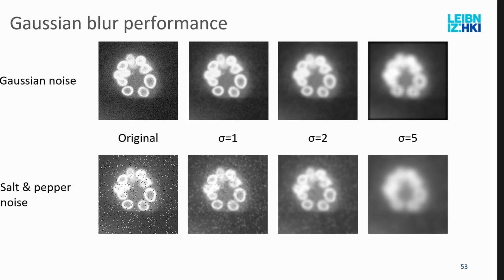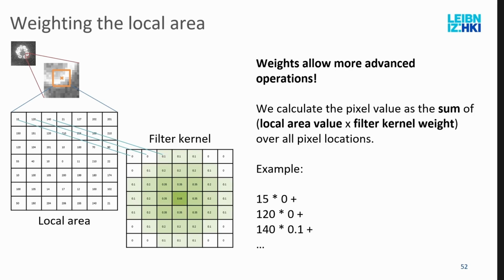And how does it behave? For the Gaussian blur filter, the standard parameter you would use is the sigma and no longer the size of the filter area. It's basically the sigma of the Gaussian, and it calculates the appropriate filter kernel size based on the sigma that you chose.